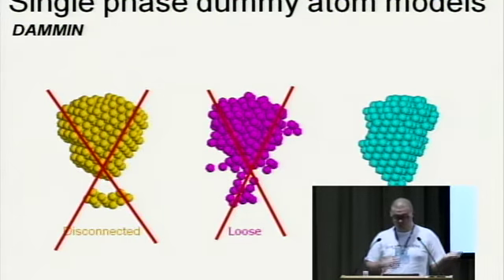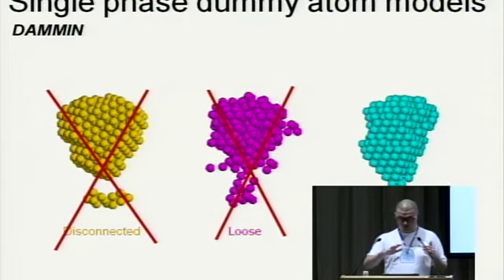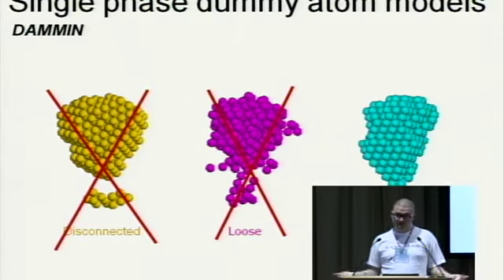And we know that, provided the low resolution that we are looking at, and by the way, I forgot to mention this, but you usually use only the low angles when you perform the dummy atom modeling. So provided our limited resolution, we need to get a compact shape.